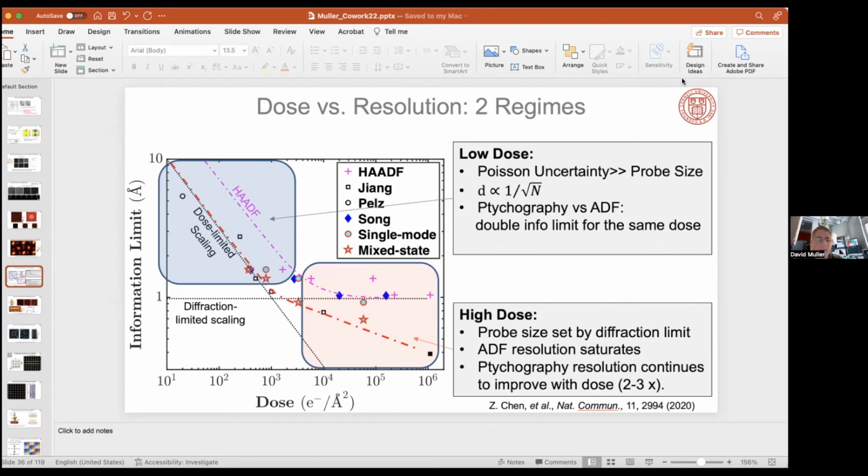So I think our rate limiting step at this point is the reconstruction speed. Right. Gotcha. I could add something from the side of the X-rays, that indeed the central information of ptychography for us in the X-rays is extremely important, and if you lose that, you give up quite a lot. So yeah, the dynamic range is also quite important for X-rays as well.